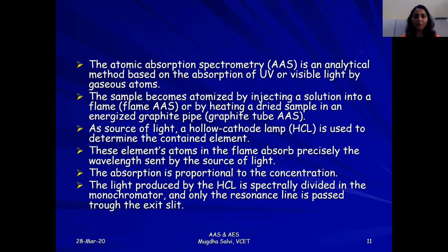Mayur, we will be seeing the nebulizer in detail further. So I'll explain the concept again when we are doing nebulizers in detail.